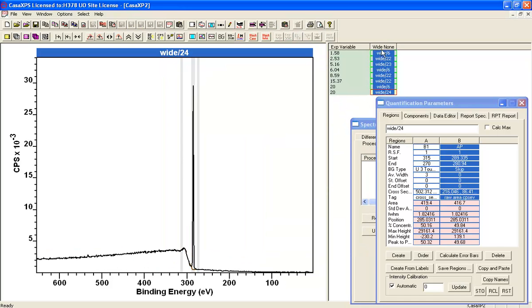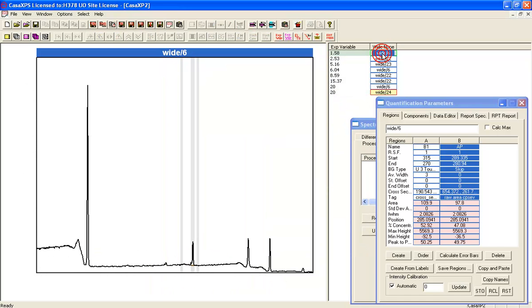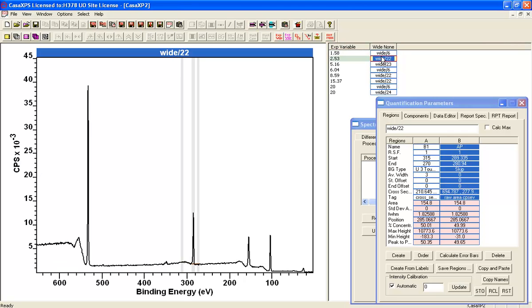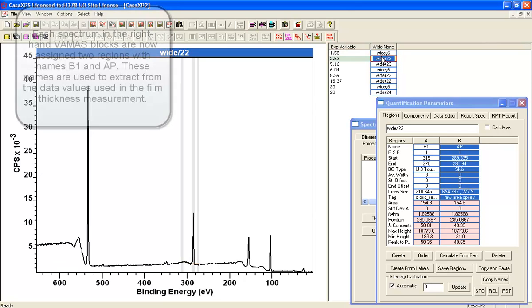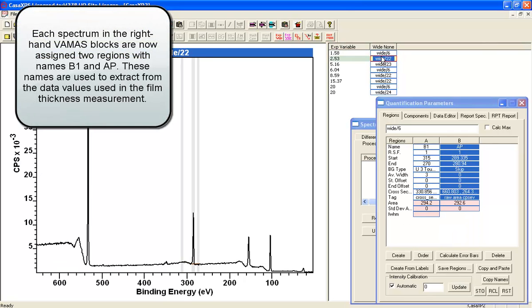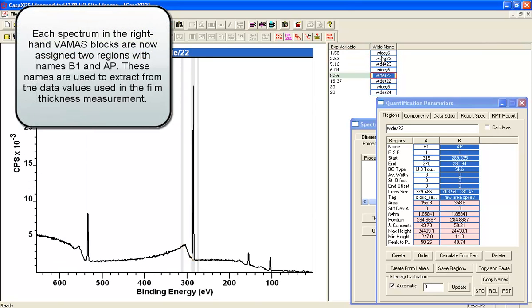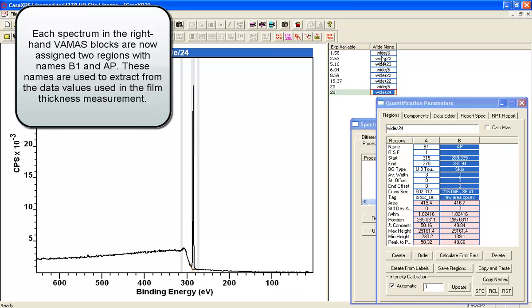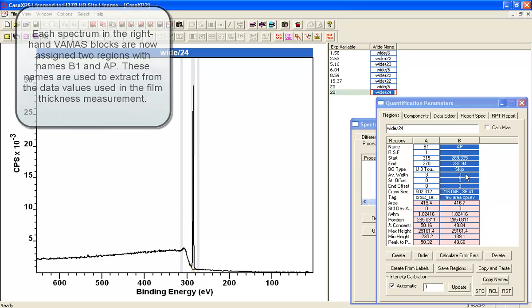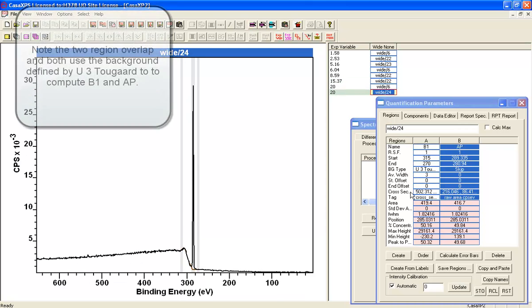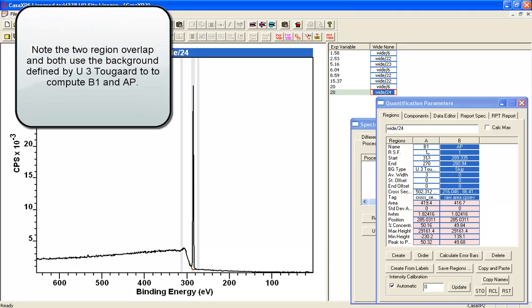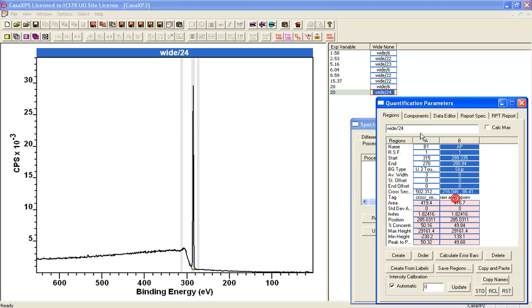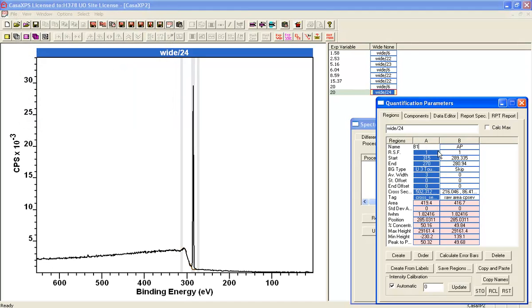So now we will find that each and every one of these spectra have been set up with two regions. And these two regions overlap. And that's because the second region is using the first region as the background. And we now have the tag fields set and the names set.